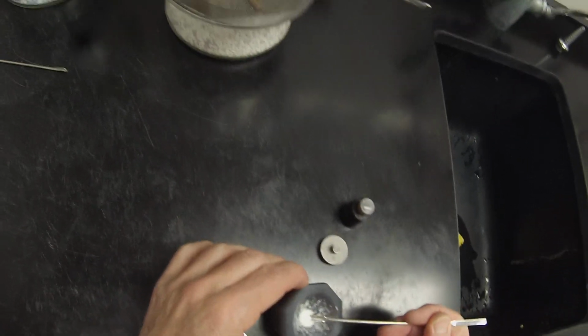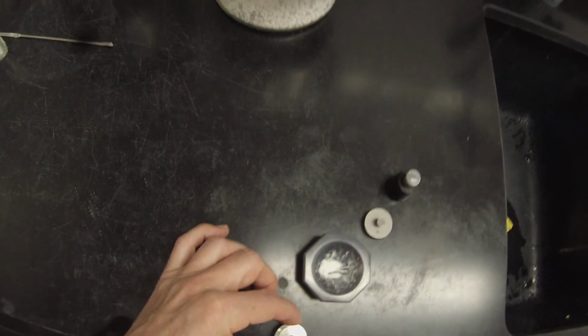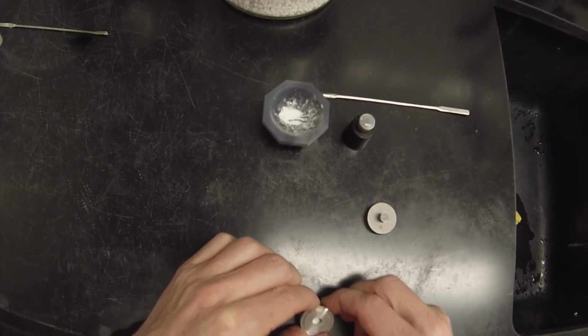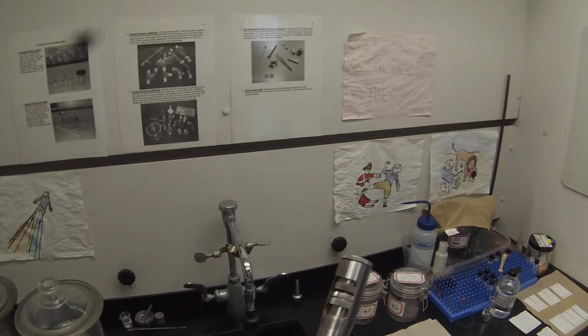So we're just going to scoop enough of that in there, just a couple of scoops full, to cover the bottom without covering it too deep. Tap that to get it to distribute. And transfer that into the pellet die, and then we'll just snap that shut.